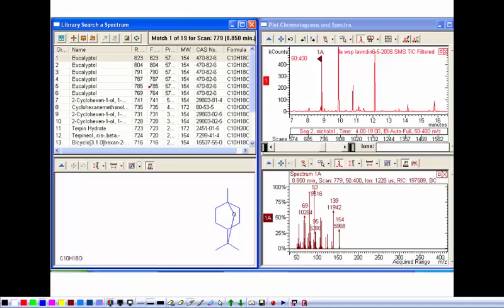So that's what they really sometimes do on the crime shows. That would be something perfectly legitimate that they might find at a crime scene and say, okay, now what is this stuff? Of course, they have databases of specific varnishes. They could tell you exactly what it is. So you can get a lot of information here, is the point. You can go through one by one and figure out exactly what each one of those components was if you had enough time and enough energy to do that. Okay?